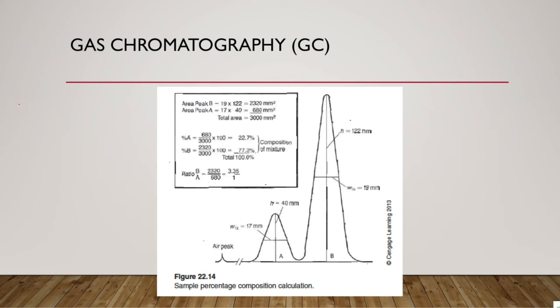In the chromatogram, basically we're going to see a graph, and the x-axis is labeled in minutes, so time, and the y-axis is the relative intensity. So let's say we have hexanes in fraction 1.